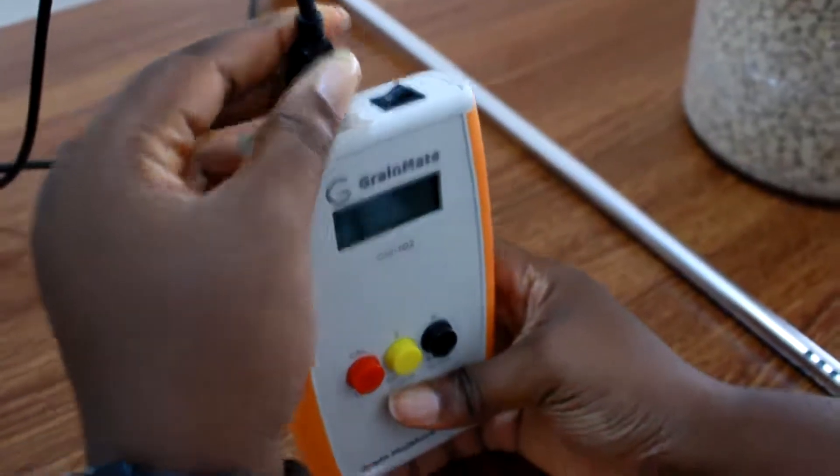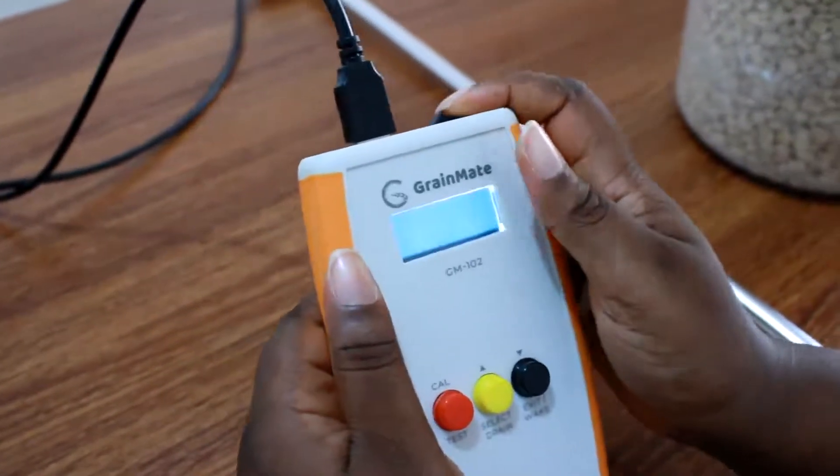First, insert the probe into the reader. Then turn on the device.